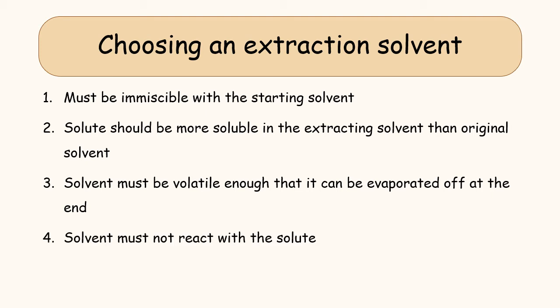And finally, the solvent you choose must not react with your compound. Some solvents will react with certain chemicals, so you just need to make sure that a reaction is not going to happen.